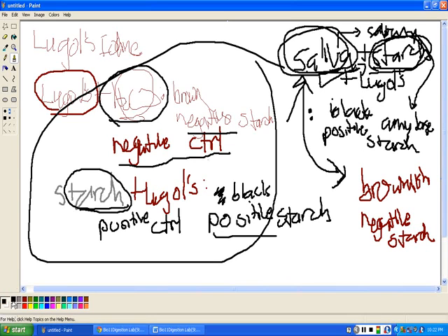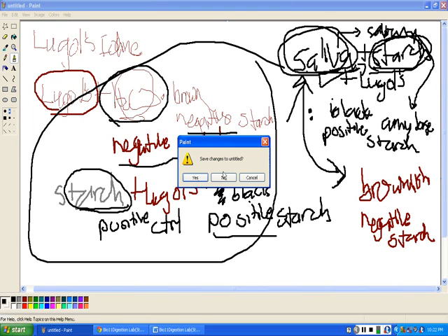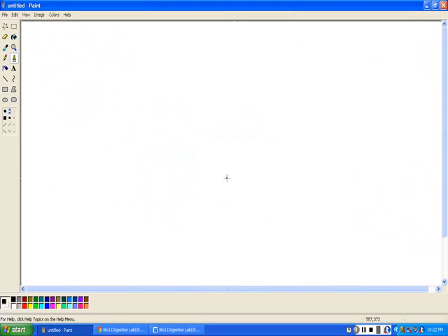I've never actually tried it out, but that would be pretty nasty if we had saliva sitting around for that long. Okay, so moving on to the second experiment where we tested monosaccharides using the Benedict's solution.